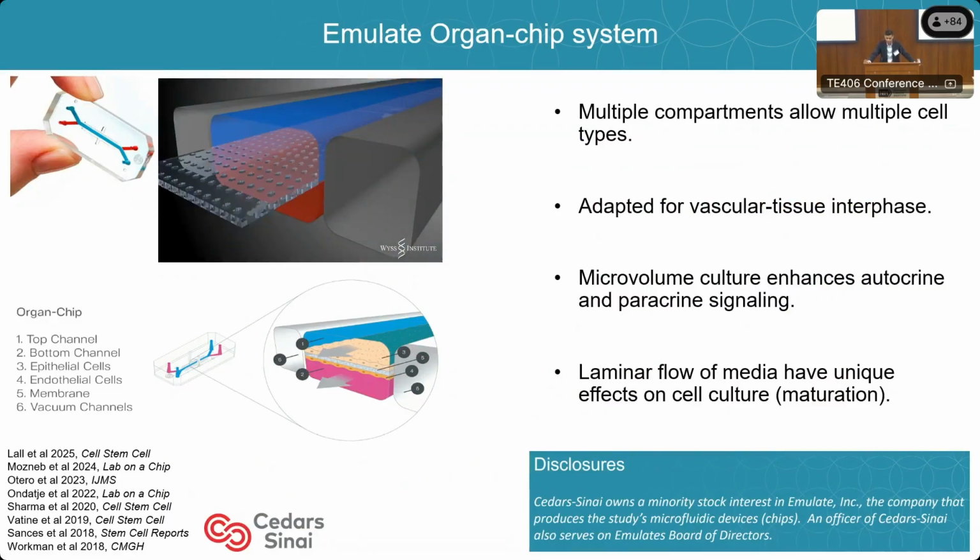It's a powerful system that allows for multiple vessels, multiple compartments that enable the simultaneous growth of different cell types. For example, you can grow cardiac vasculature simultaneously with cardiac myocytes, mix and match, with different neural cell types as well. And just highlighting on the bottom left of the slide there, a number of the publications that we've published in our Regenerative Medicine Institute using this technology.